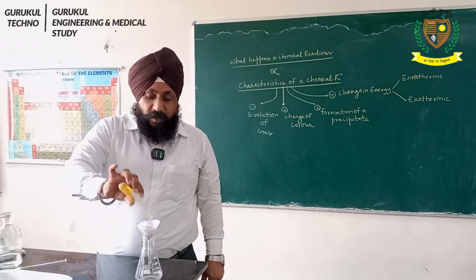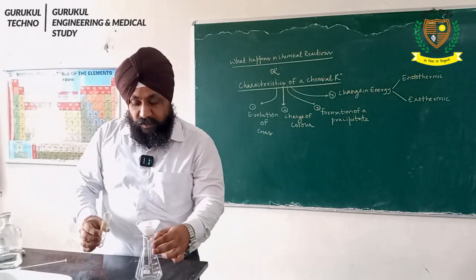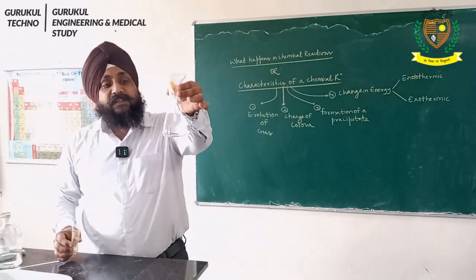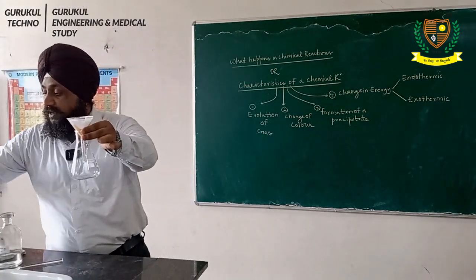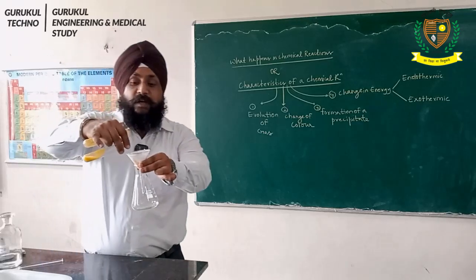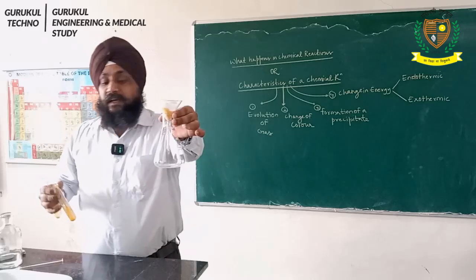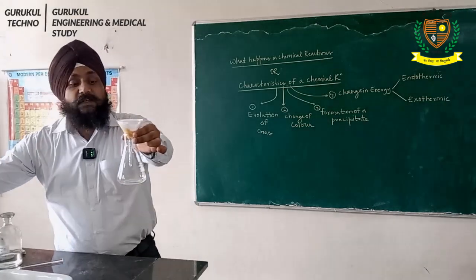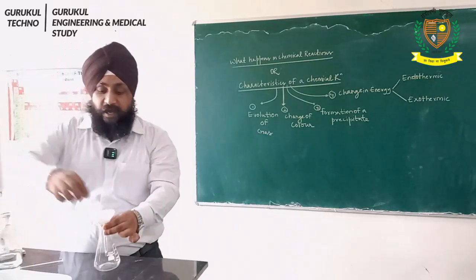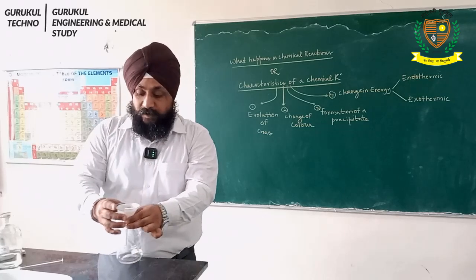See, down in the conical flask, a clear solution is getting collected, and the insoluble substance is on the filter paper.